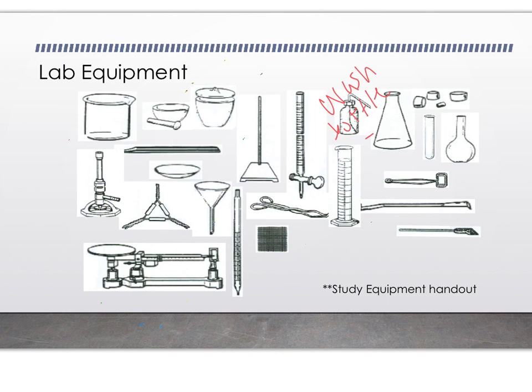This next picture, this is known as an E-flask or an Erlenmeyer flask. This is a container that temporarily stores different types of liquids. You can also use it to heat, but most of the time it's used to transfer liquids from one location to another.